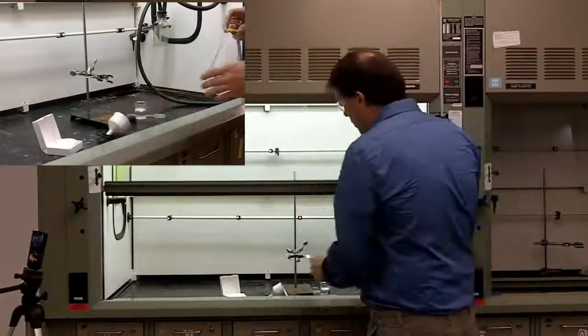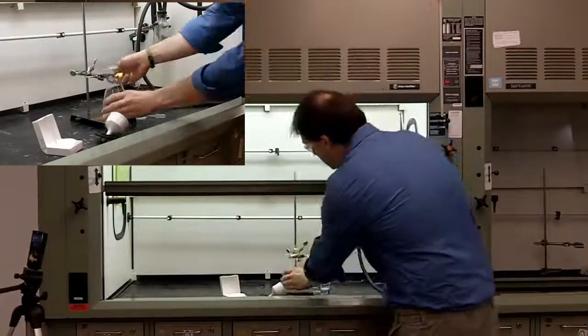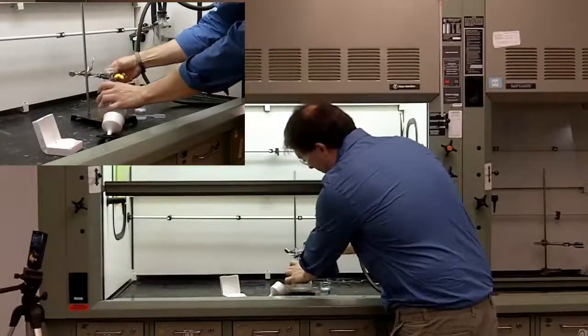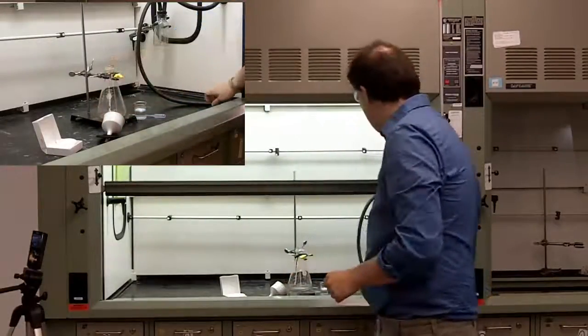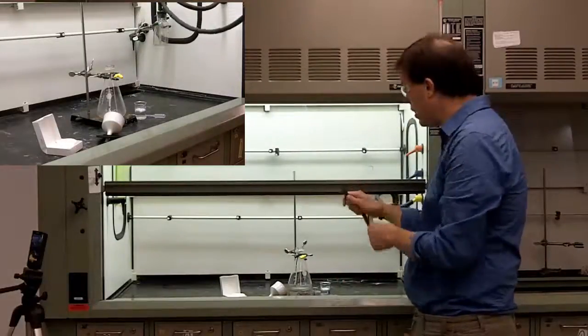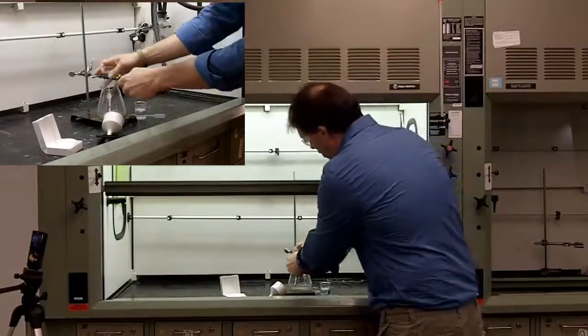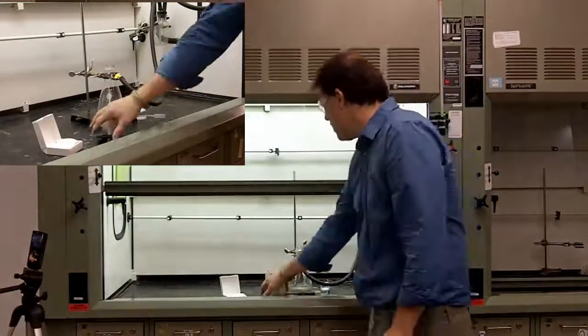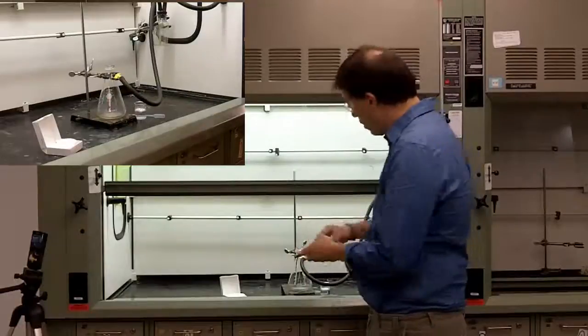So to set it up, it's relatively straightforward. You take your sidearm flask, put it inside of the three-prong clamp, take the end that is open here and attach it to the suction filtration flask like this.